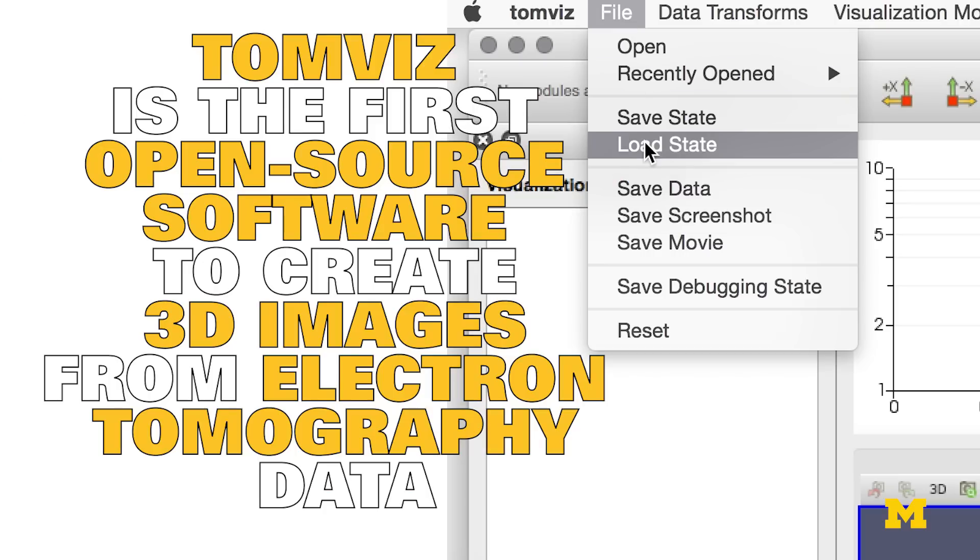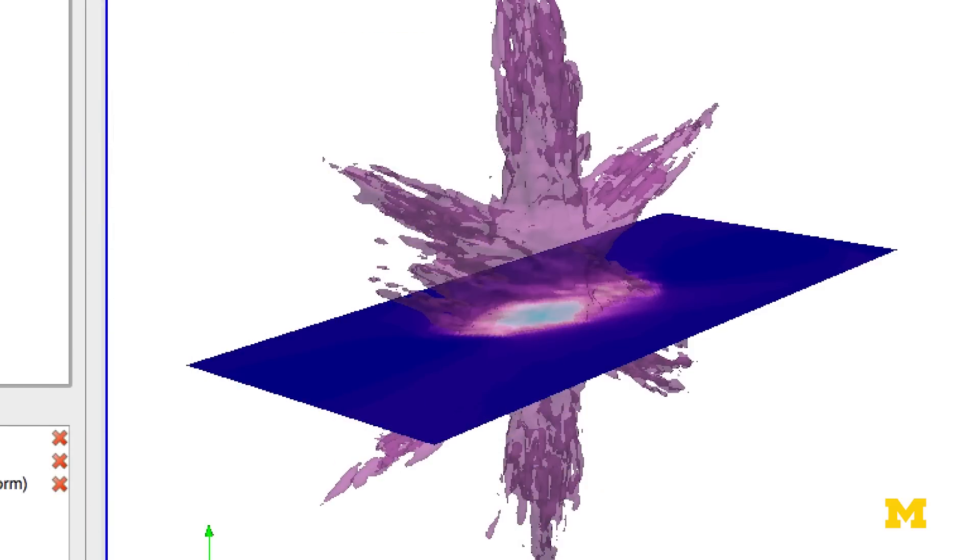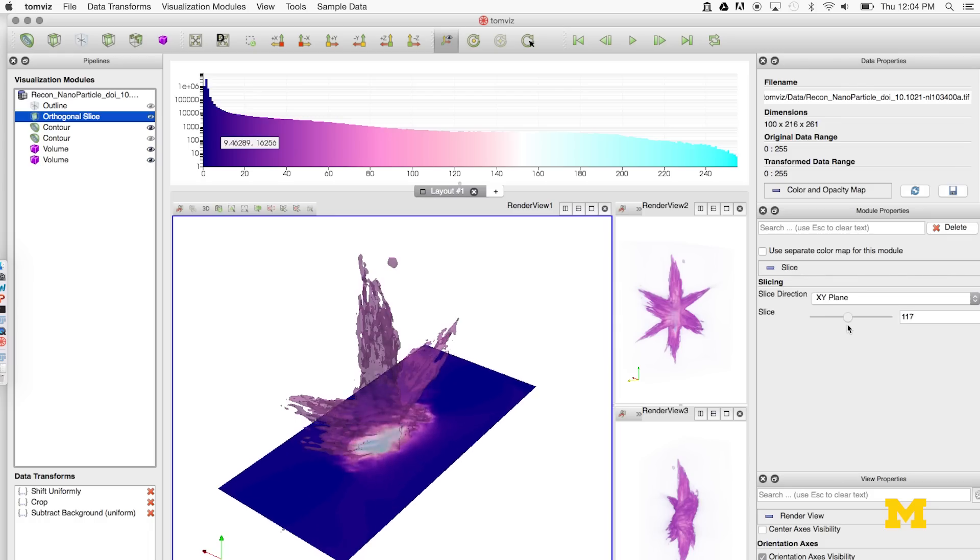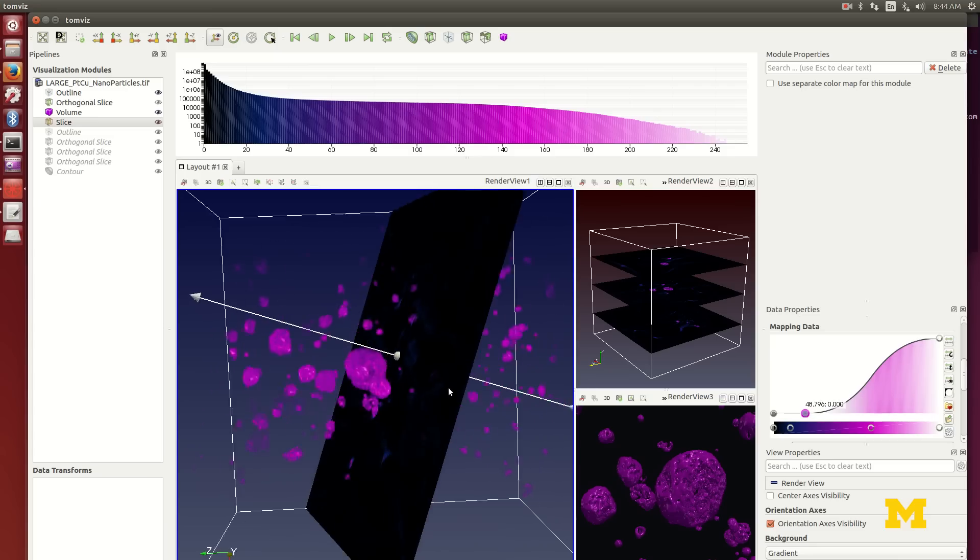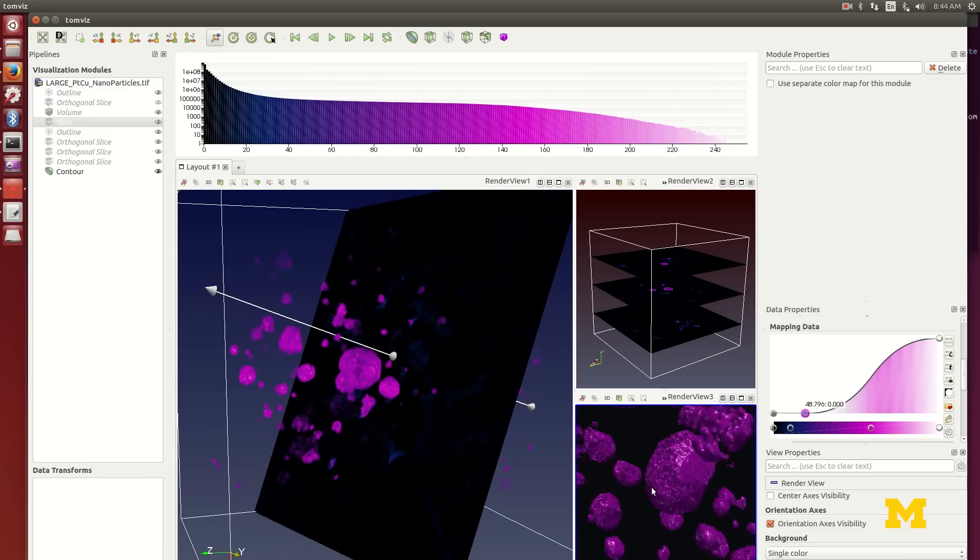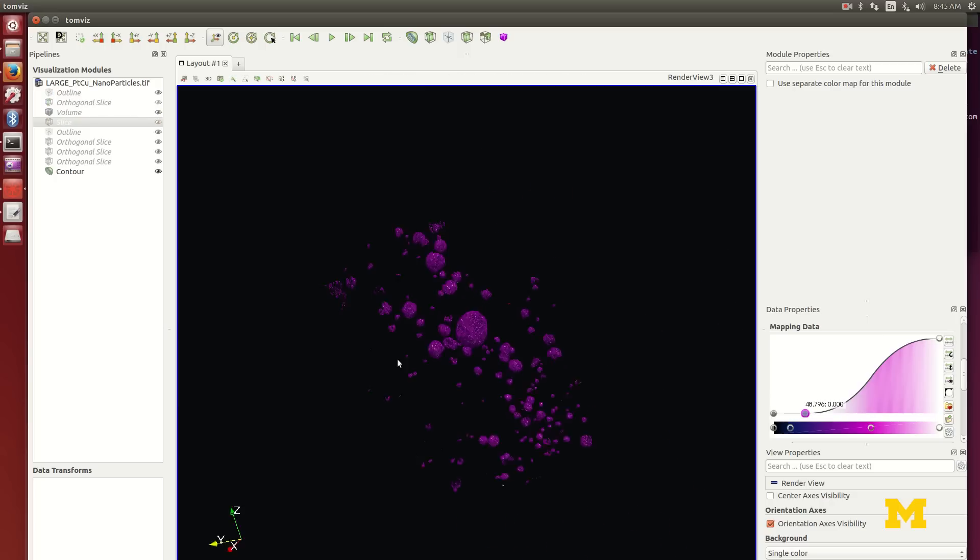TomeViz is a powerful three-dimensional imaging platform where you can analyze any three-dimensional structure, but in particular nanoscale materials so you can spin around, you can interact, you can understand the true structure at the nanoscale.